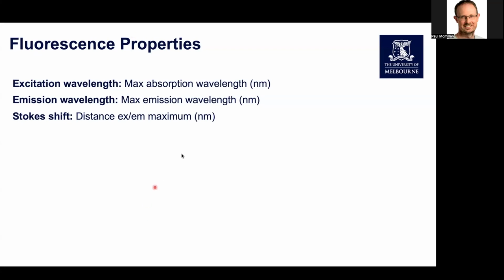Okay, everyone, hopefully everyone's had a chance there to get through the poll. So the first question is, what is the correct order of events in fluorescence? The answer there is, first of all, absorption, followed by excitation, and then emission, which looks like most people have got. Question 2 is, what best describes Stokes shift? The correct answer there, which again most people have got, is heat loss that results in an emission of a longer wavelength photon. So you remember the emitted wavelength is longer than the excited wavelength, lower energy, longer wavelength.